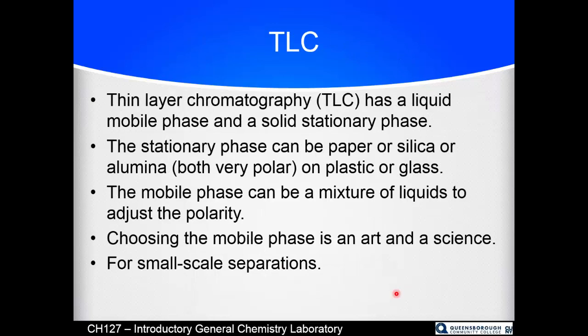So TLC stands for thin layer chromatography. TLC is thin layer chromatography. And it's thin because it is literally thin. I'll show you a picture, but you're looking at a glass plate with some sort of adsorbent material on it, silica gel or alumina. And so it is relatively thin.